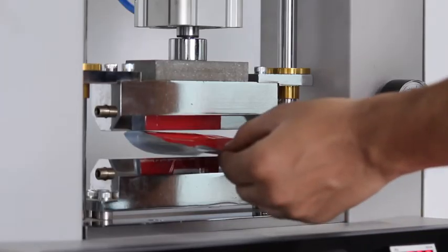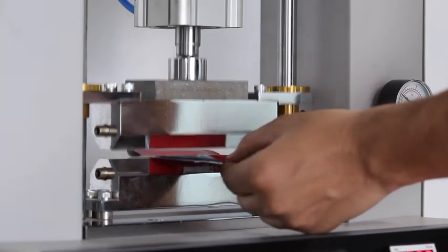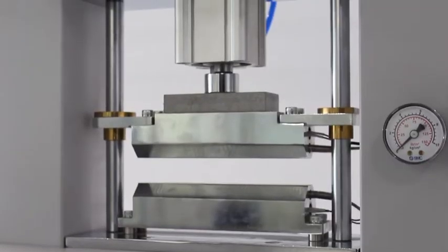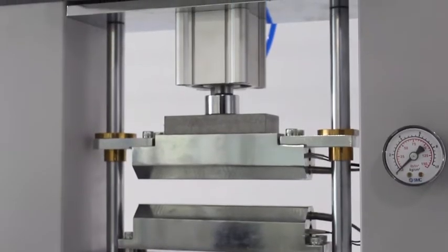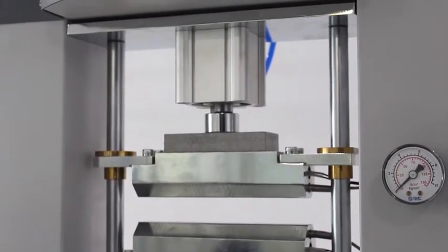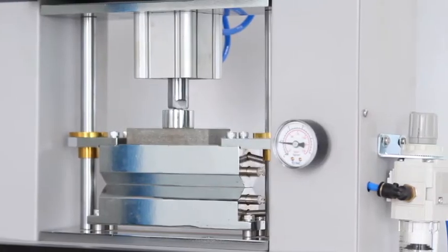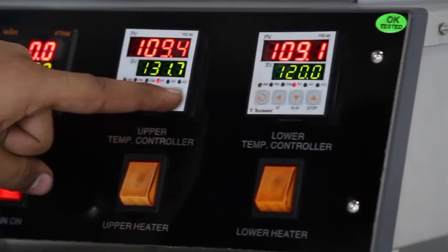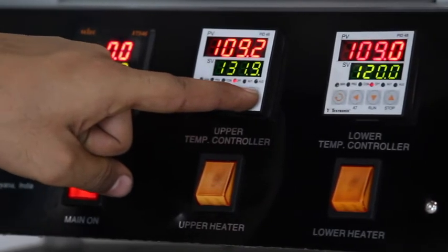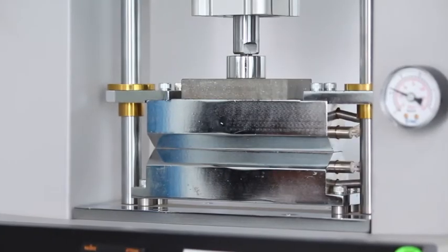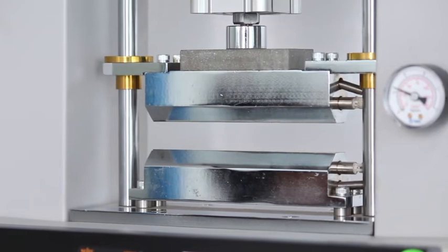The instrument has a high-accuracy temperature control system for conducting heat seal tests, adopting the design of an underlying single-cylinder closed-loop. The pressure control system can perform automatic pressure tuning, which ensures high-accuracy pressure control and pressure stability during the testing process.